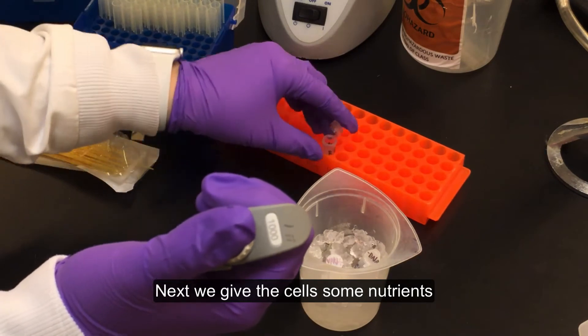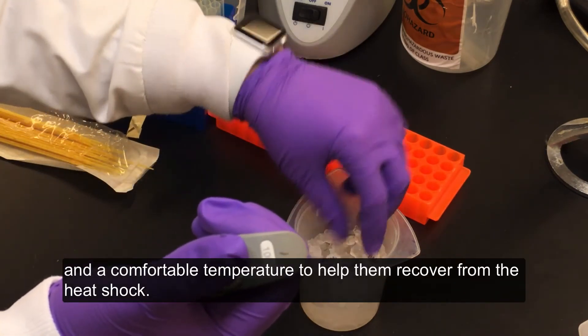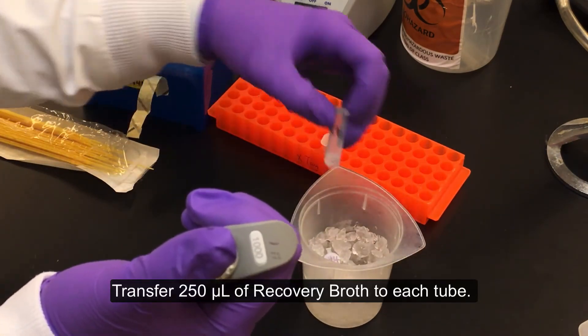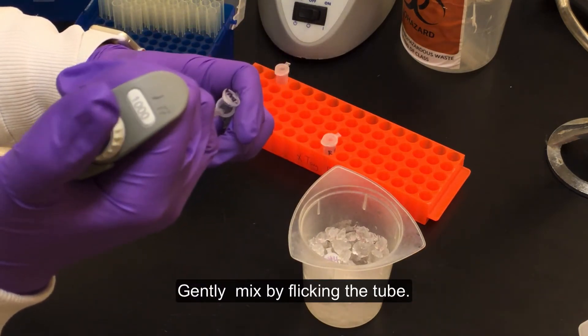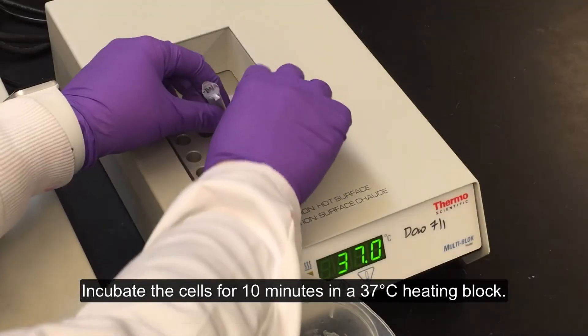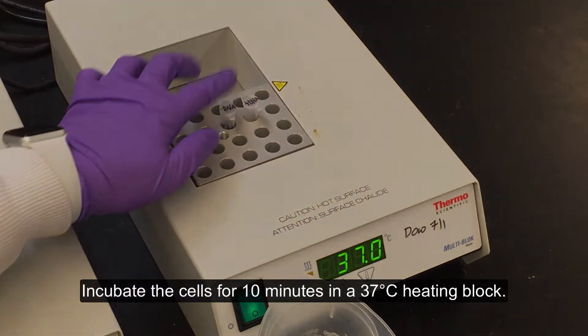Next we give the cells some nutrients at a comfortable temperature to help them recover from the heat shock. Transfer 250 microliters of recovery broth to each tube. Gently mix by flicking the tube.